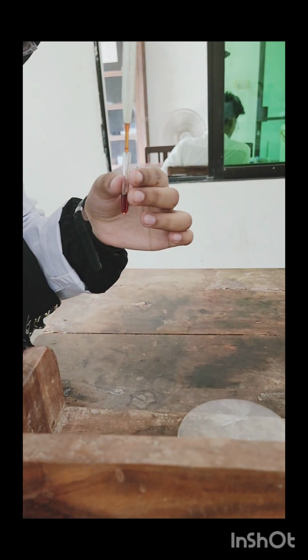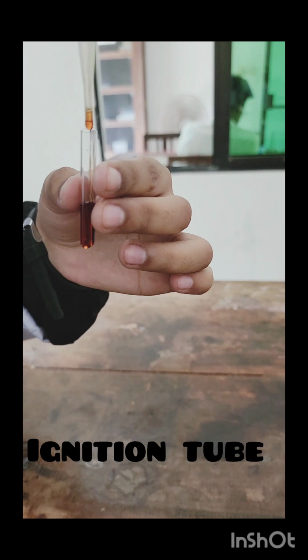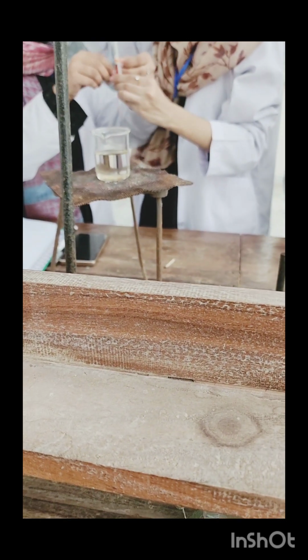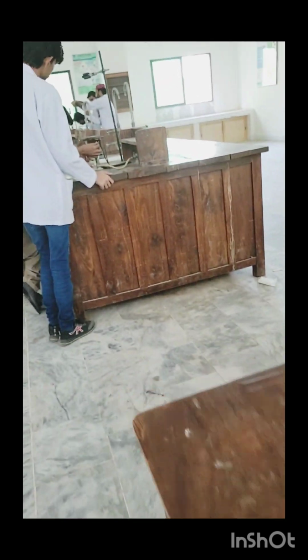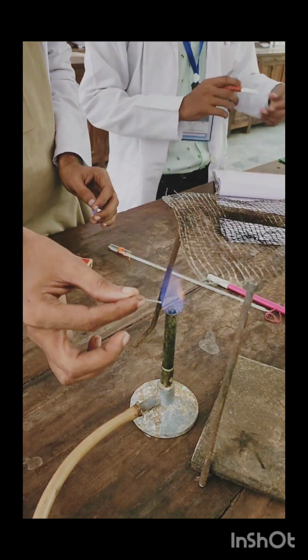This is aniline. My girls are now, you can see, tying the thread. The thread shouldn't be so long that it would be immersed inside the paraffin oil. It has to be very short. Or cut it. Just cut it down. Sealing the capillary with red.